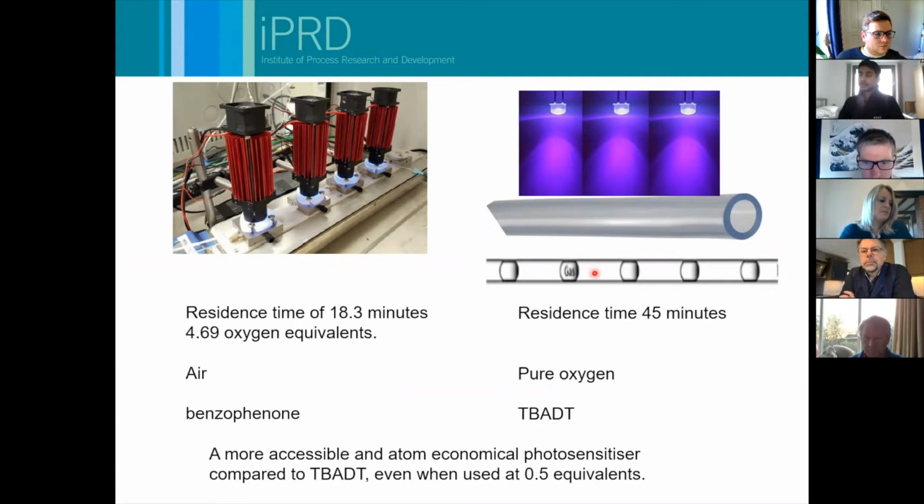That's contrasted with photochemistry within the tubular system. If you were doing a gas liquid reaction like we're doing here, you would have slugs of gas, slugs of liquid, slugs of gas, and your light intensity will be highest nearest the top of the tube. So there's really good advantages to doing photochemistry within CSTR systems. And we found really good performance of our gas liquid systems in this example here.